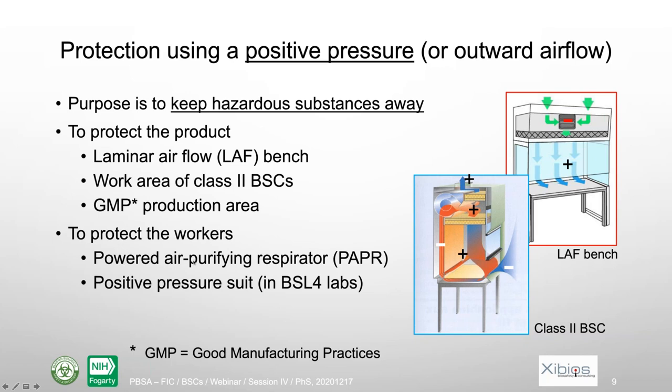It's the case for some respirators, PAPR for those who know that, but also for positive pressure suits that are used in BSL4. So we can use both negative pressure to suck the hazardous substance away from the operator, or positive pressure to keep them away also. So depending on the situation, you can work on both.